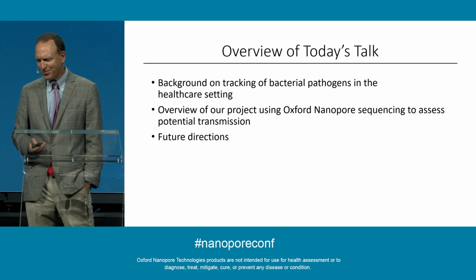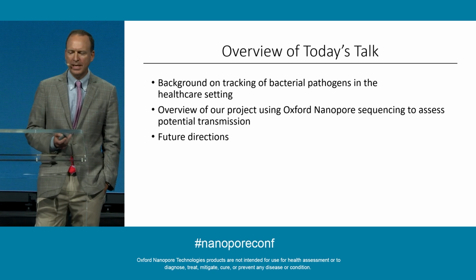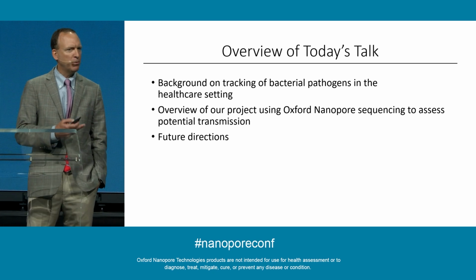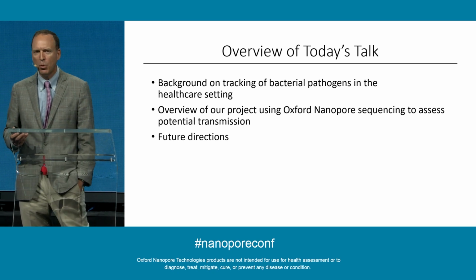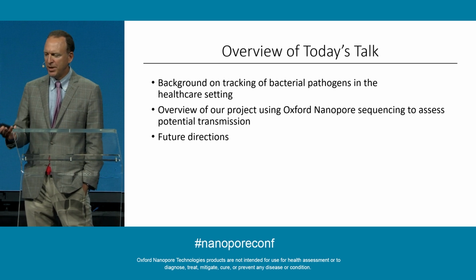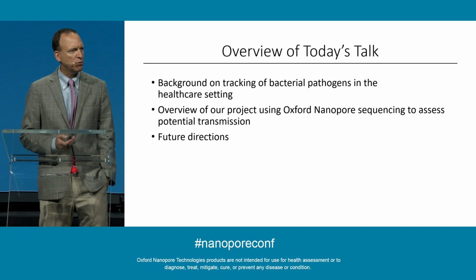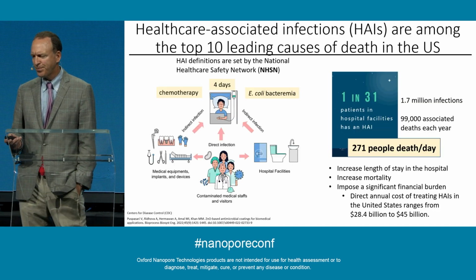So what I'm going to talk about today is why we're interested in tracking bacterial pathogens in the healthcare setting. We heard a little bit from Gordon about how ONT is being used from an infectious disease standpoint. I'm going to expand a little bit upon that. I'm going to talk about our project. That'll be the nuts and bolts about using Oxford Nanopore sequencing to assess potential transmission of these pathogens. And I'm going to touch briefly upon future directions.